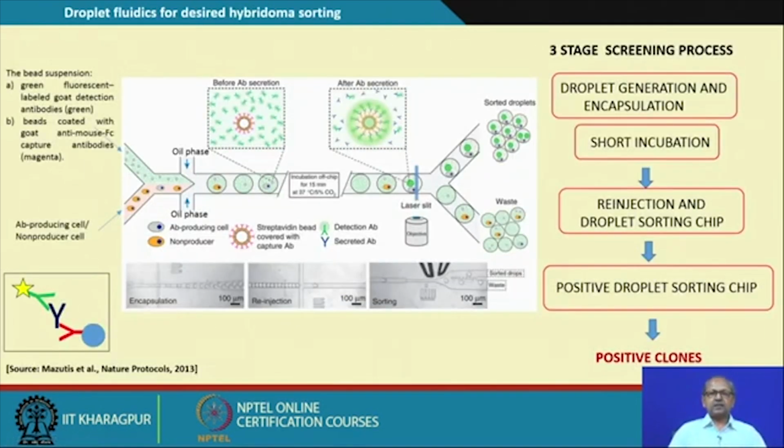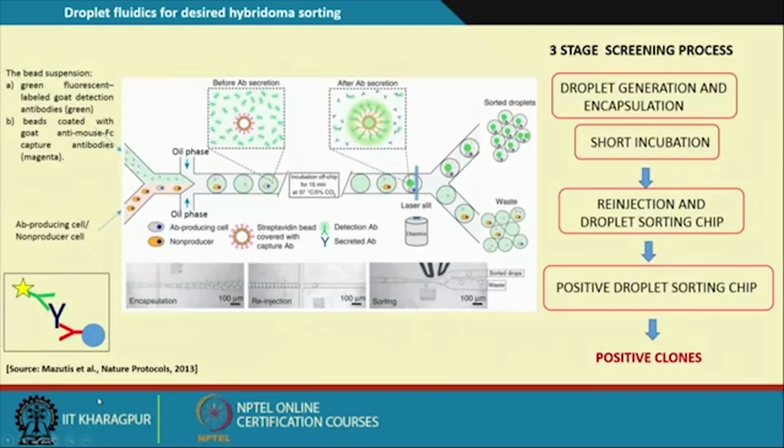As I mentioned, the next step will be screening of the hybridoma cells for antibody secretion, meaning the positive clone. So, before going to that experiment, you have to select how to screen, how to experimentally observe that antibody is secreted, and assay that antibody. Here the technique is like direct ELISA, what we have done earlier, which is a macro scale process.